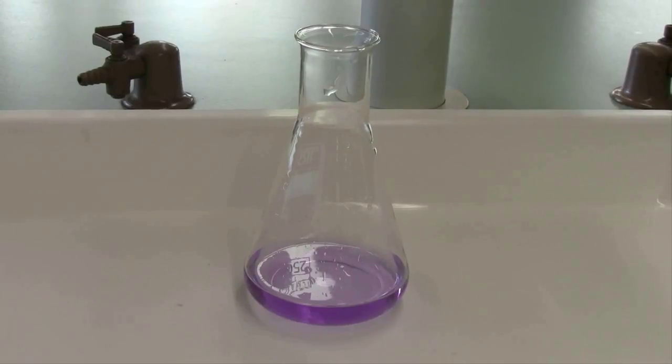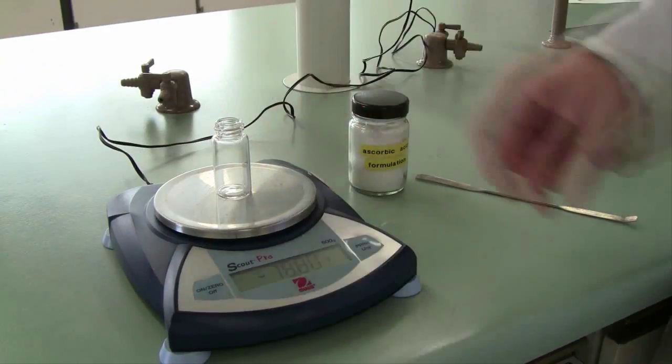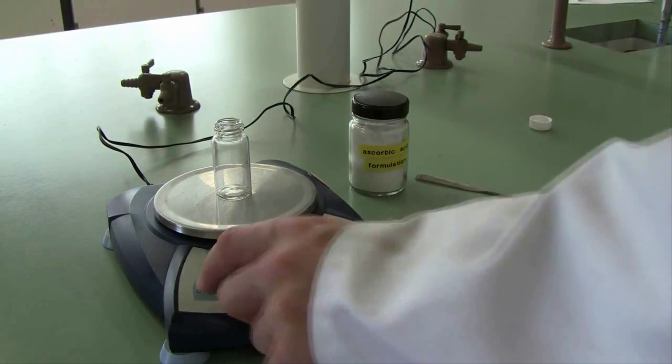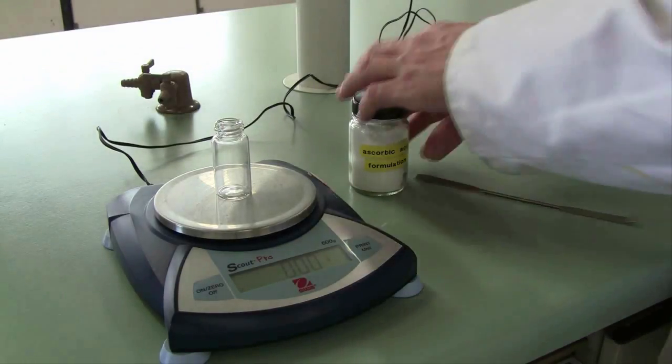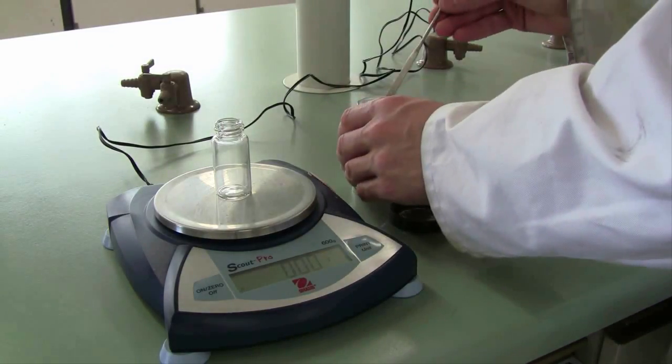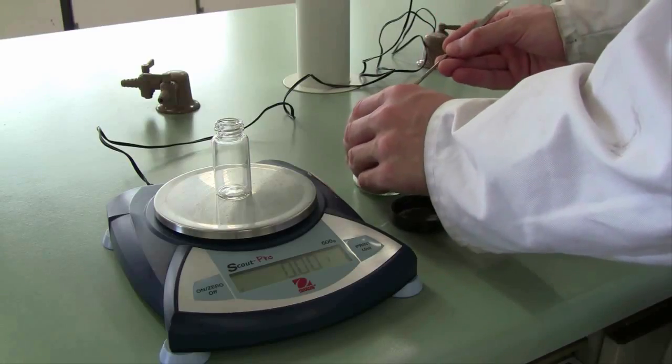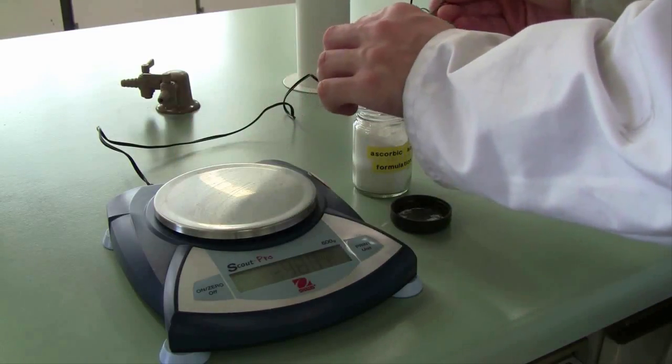Once you've completed these titrations, it will then be time to move on to the ascorbic acid analysis. Use a top loading balance to weigh out approximately 0.4 grams of the ascorbic acid formulation. The exact mass isn't important as long as it is close to that 0.4 grams - somewhere between 0.35 and 0.4 grams will be fine.